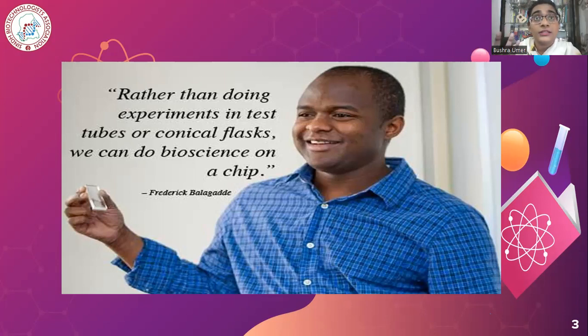We are also reducing the size of the sample. Since the chip is very small, a small sample size is required, and we are also reducing the reagents that are being used in that particular experiment. So yeah, it is fascinating to use a chip for life sciences experiments.